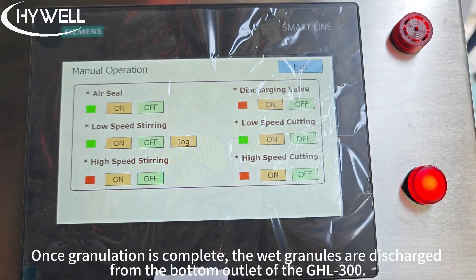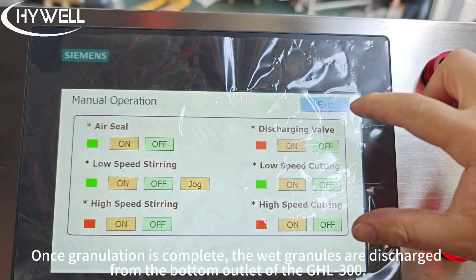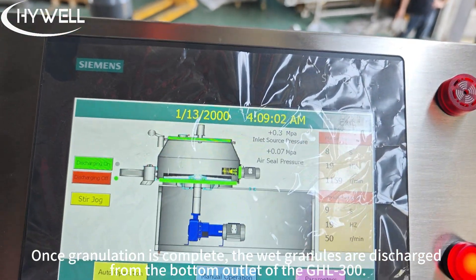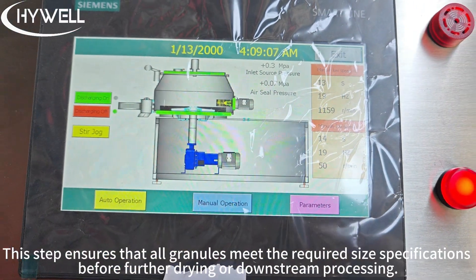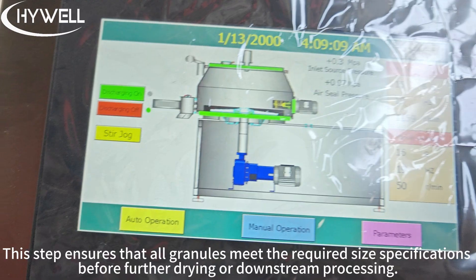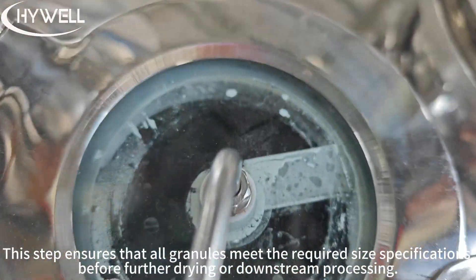Once granulation is complete, the wet granules are discharged from the bottom outlet of the GHL300. They are then directly transferred into the granulator for size reduction. This step ensures that all granules meet the required size specification before further drying or downstream processing.